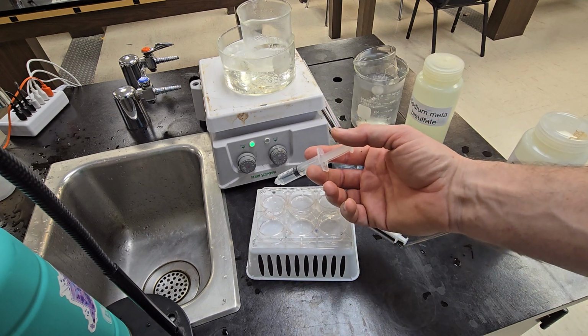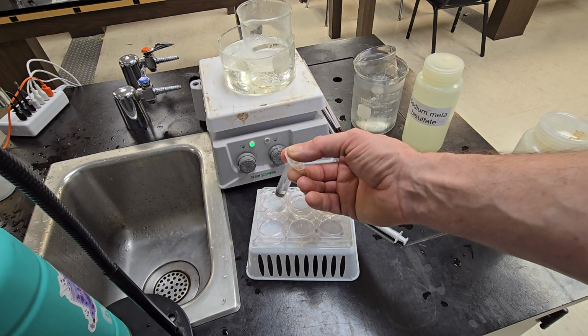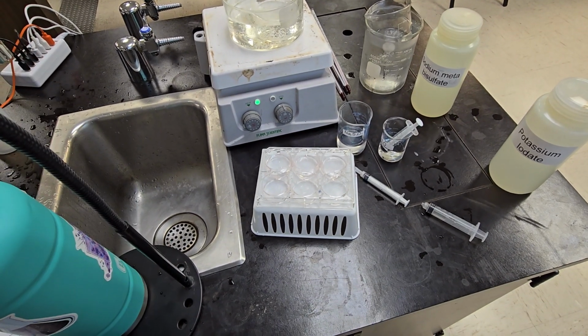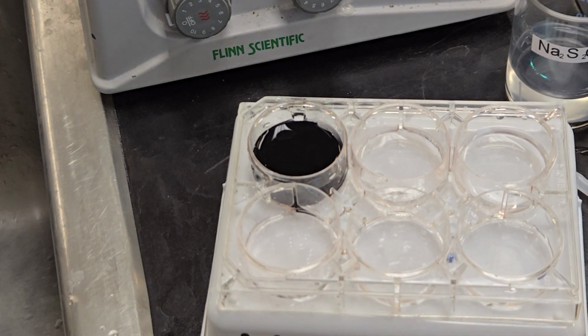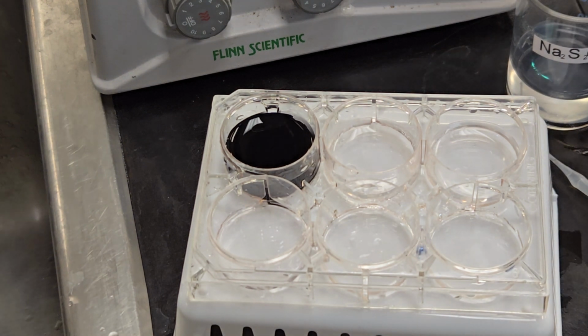Again, the second I start adding, you look at the time on the YouTube video, starting now. There you go, right there. Now we're going with the hot potassium iodate. Three milliliters.